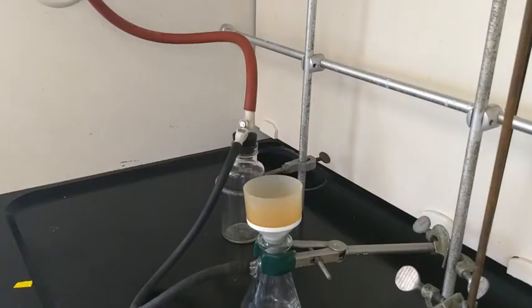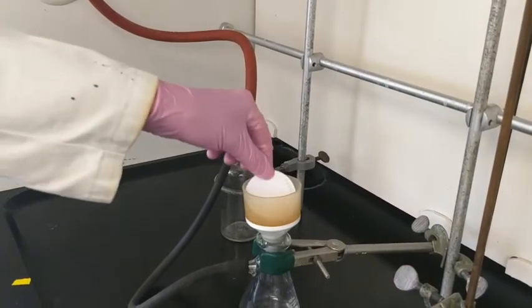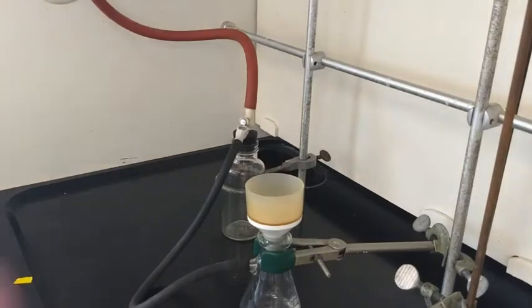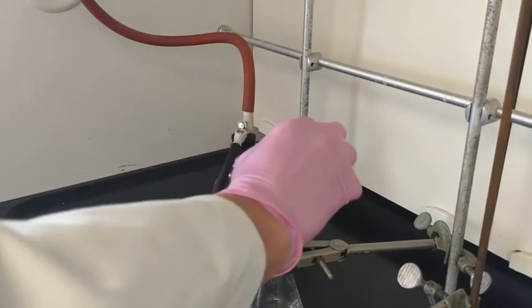I'll pre-weigh a filter paper and then label it with the mass in pencil. Then I'll place it into the filter and add a little bit of water — or the solvent we'll be filtering out of, usually water — and that makes a good seal so the solution doesn't go around the back end.